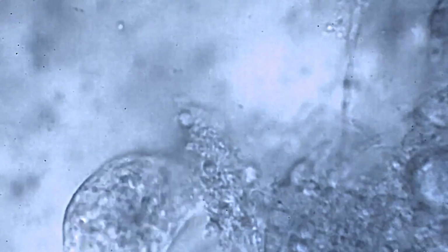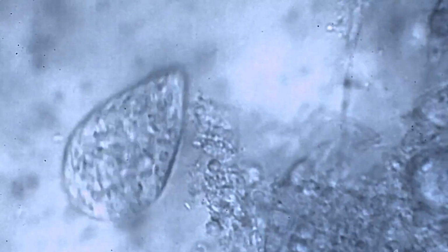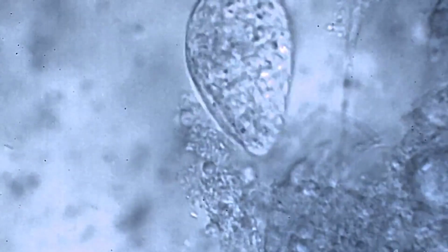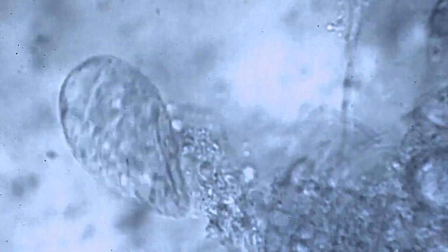Some electrons are scattered by dense parts while others pass through. The resulting image shows internal details. A TEM can reveal tiny organelles like ribosomes and endoplasmic reticulum. It can magnify up to 1,000,000 times or more, with resolution better than 0.1 nanometers.